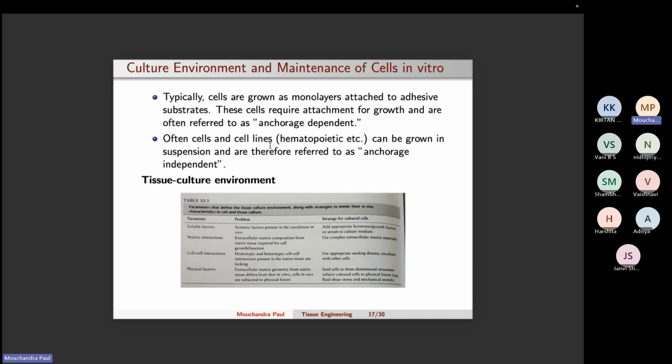Okay, so the air that is circulating inside the laminar airflow hood is sterile, and since the flow is laminar, it acts as an invisible curtain, preventing the entry of outside air. So a laminar airflow hood is needed. Also you need an incubator, and that incubator also needs to be maintained in sterile conditions. You have to be very cautious while opening and closing it. You shouldn't open it for too long, otherwise outside airborne microbes can enter.